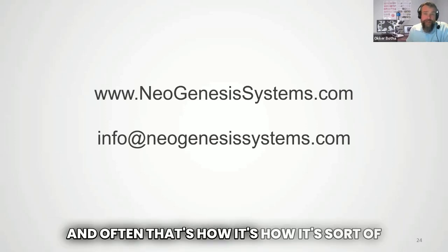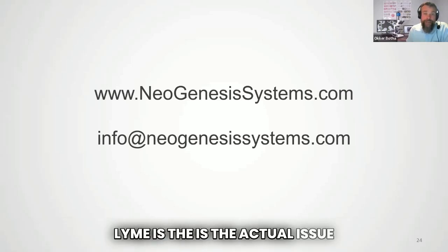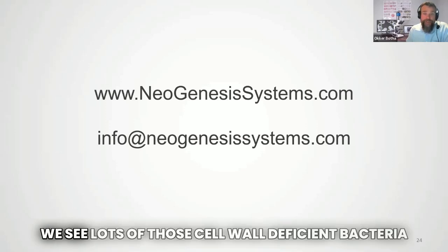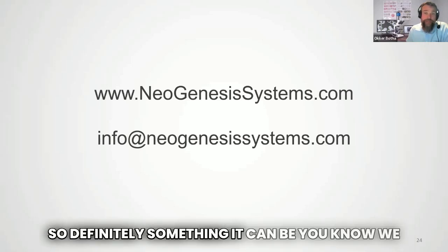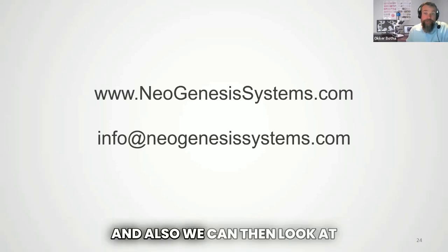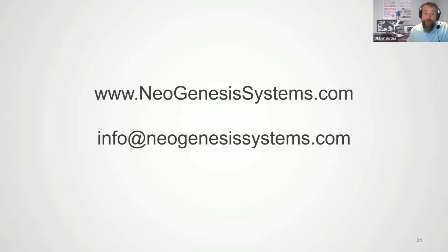That's often how one would work out that Lyme is the actual issue. In cases that I've had with Lyme disease, we see lots of those cell wall deficient bacteria, so we can work out whether that is the issue, and we can also look at those patterns during the course of treatment to see that it is actually improving.